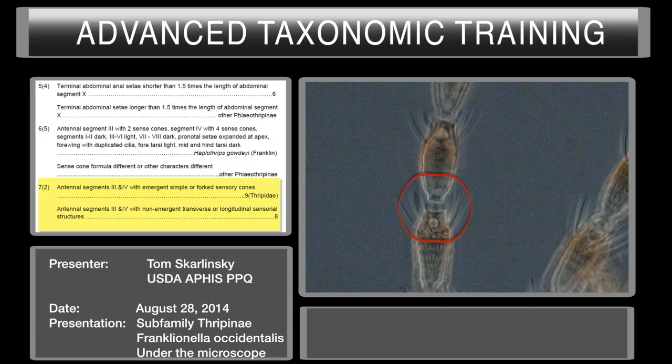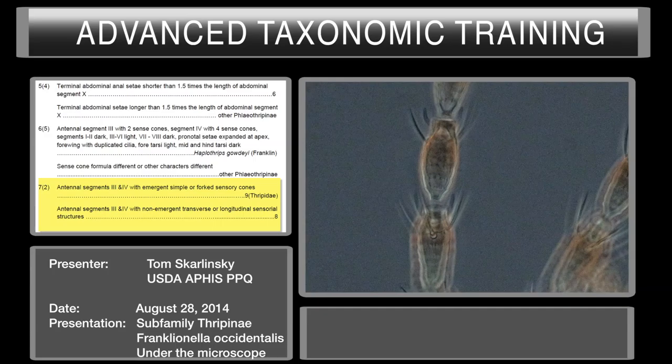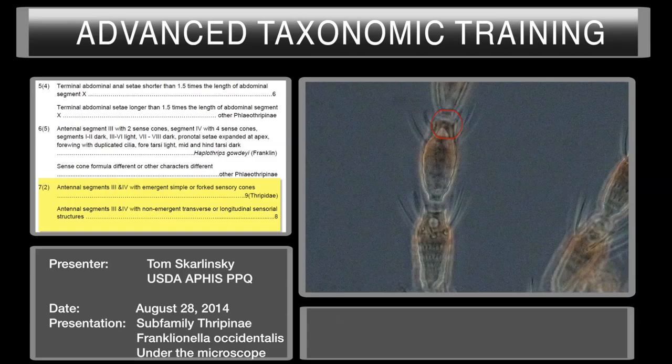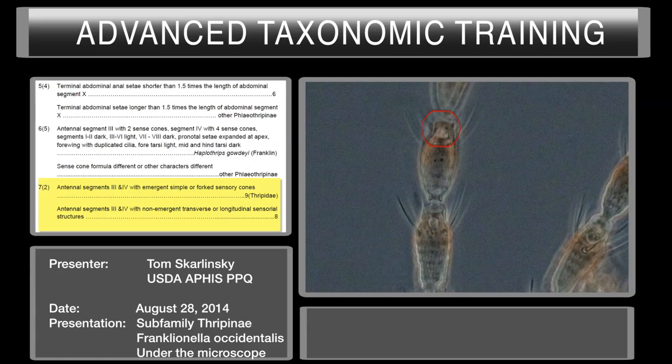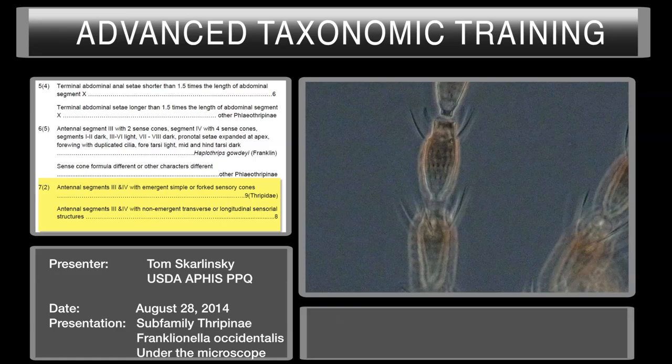It's right there. Loops right around. Usually that round base is pretty obvious. The actual four-sense cones a lot of times it's difficult to see both branches, so you usually see that large basal section as a point of reference. We've pretty much determined that we have emergent forked sensory cones. So we're going to move on, and we have the family Thripidae.